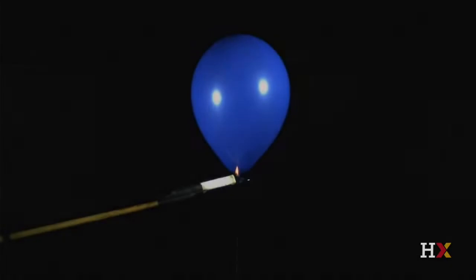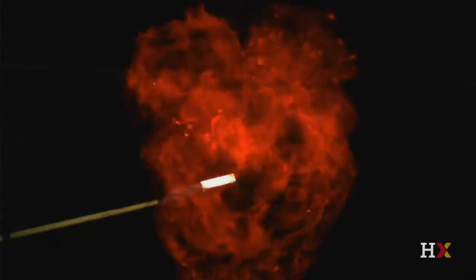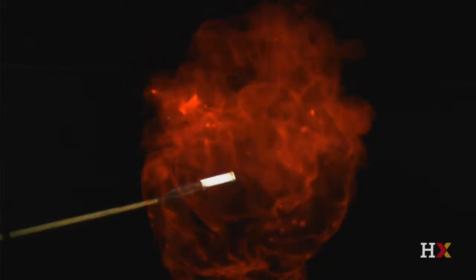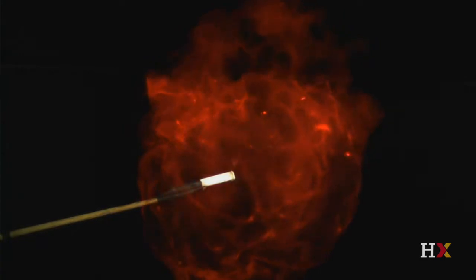Let's review the process in slow motion. The balloon skin peels back due to surface tension, and the hydrogen gas rushing out of the balloon extinguishes the candle flame. As the hydrogen gas molecules rush out of the balloon, they react with oxygen gas molecules in the surrounding air, producing a growing fireball.